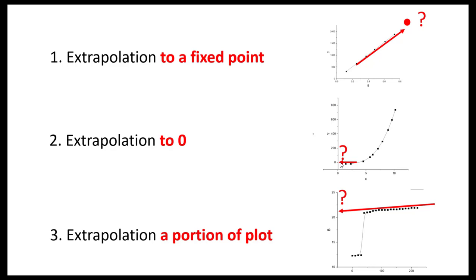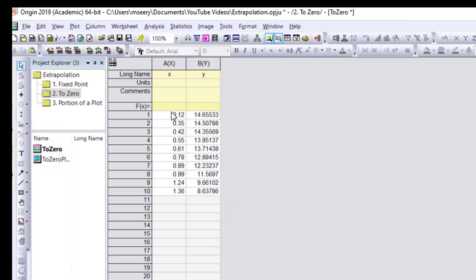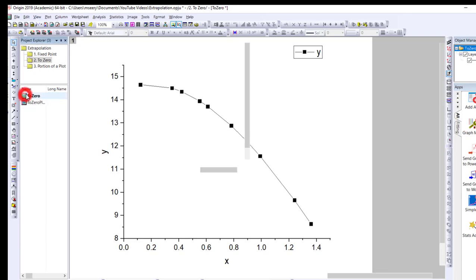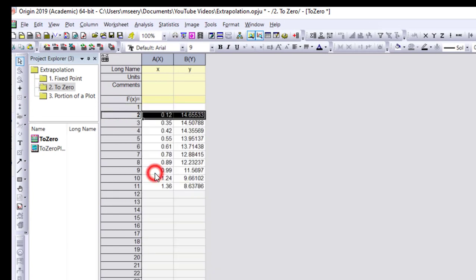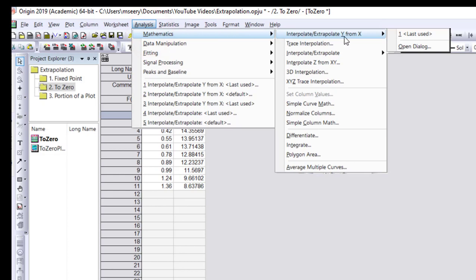In the second example we want to extrapolate backwards — extending a curved plot back to zero. We may or may not know the underlying equation of the curve, but that's for another time. The trick is to insert a row and type in the x value we want to extrapolate back to, which here is zero. Then go to Analysis > Maths > Extrapolate Y from X, choosing our x values including the unknown point.